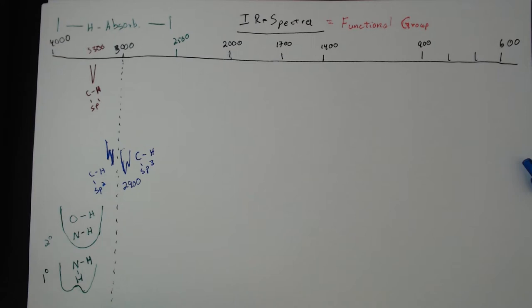Those are your basic hydrogens on carbon. The other types of hydrogens you run into are primarily OH's and NH's. Both absorb around 3,300 but tend to be much larger than a simple CH. Depending on how much hydrogen bonding is occurring — whether it's a solid crystal with almost no hydrogen bonding, giving a pointy peak, or a liquid with extensive hydrogen bonding — these usually look like broad humps. Most people distinguish the OH or NH bond as being at 3,300 but usually appearing as a broad hump.